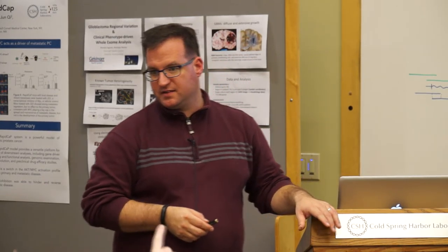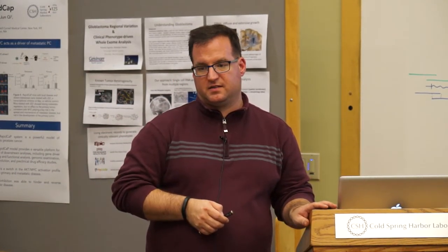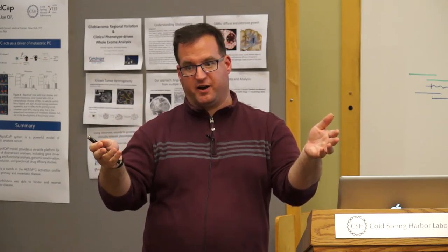Okay, great. Question: you just said with the Illumina machine, you prefer some of the reads because you have a lot of them, because of shorter reads. For some of the genes, and this is just an example that seems to come up a lot with pseudogenes and PMS2, it seems like PacBio would be a good machine to sequence that in particular because of the pseudogene. How can you make up for that with Illumina where you have shorter reads? Yeah, so we're going to talk about assembly, about figuring out the structure of a piece of DNA or a piece of RNA, and we'll talk about that.